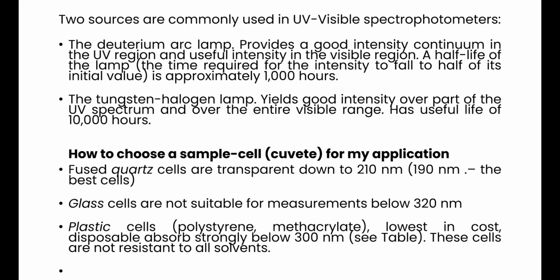So when it comes to cuvettes or sample holders, there is a lot more to talk about, but this is just to acquaint you with the terminology related to the spectrophotometer. So with this, the introductory session on spectrophotometer is done from my side.